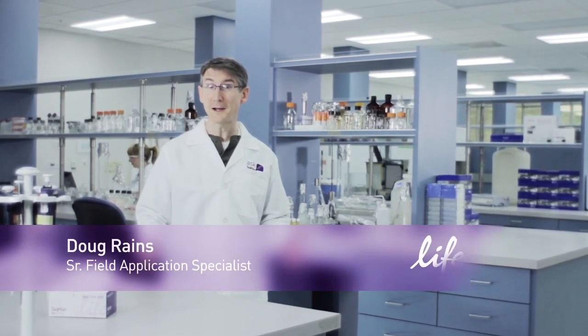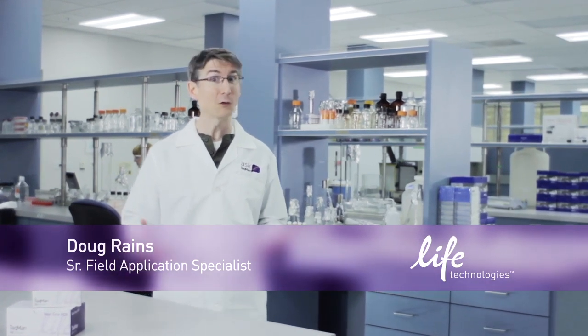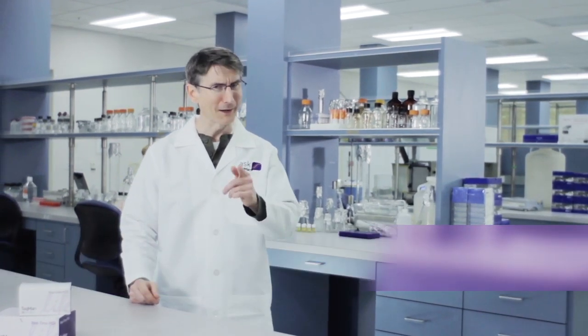Over the years, I've been asked quite a few times which quencher molecule is the best choice for a TaqMan probe. Excellent question. To answer that, let's look at a couple of different options. Applied Biosystems real-time instruments officially support two different quenchers, the first of which is an oldie but goodie called TAMRA dye. TAMRA dye has been around for a long time and it's still widely available.